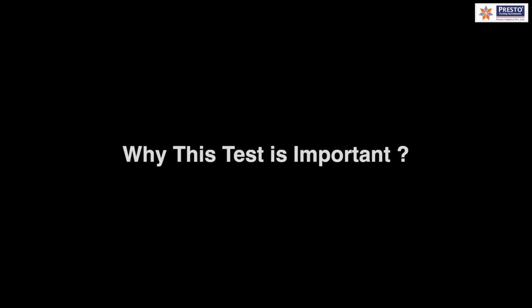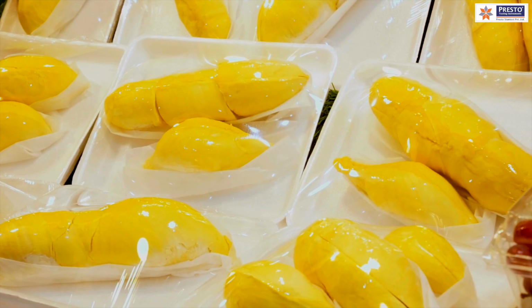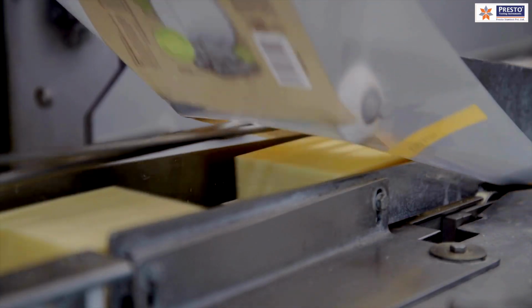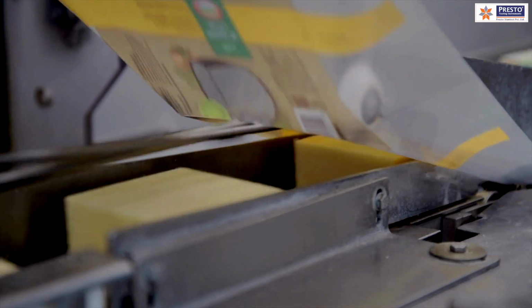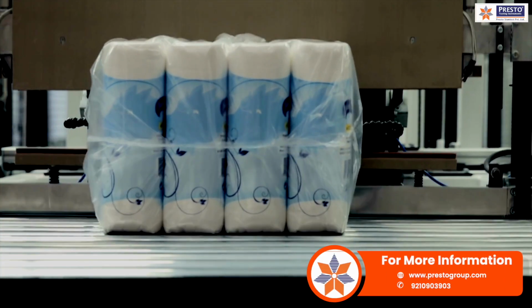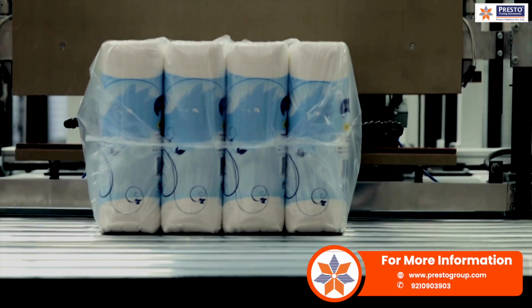Now, why is this test important? Whether it's food packaging, lamination films, barrier layers, or medical grade plastics, knowing how your films behave under tension helps in design, quality control, and compliance.